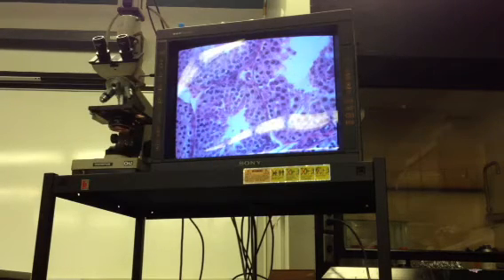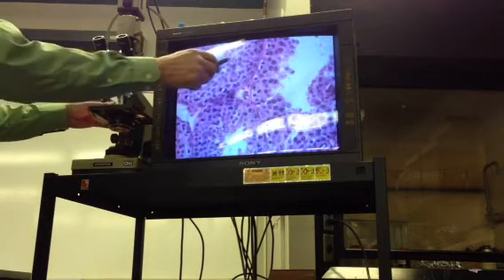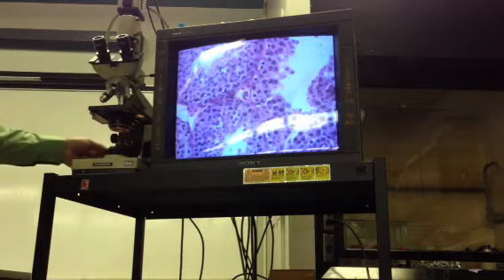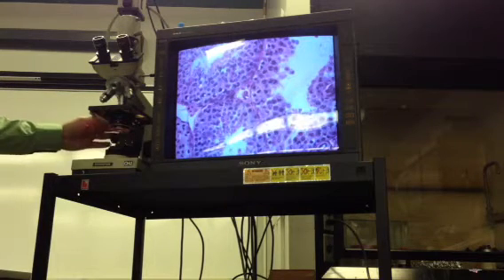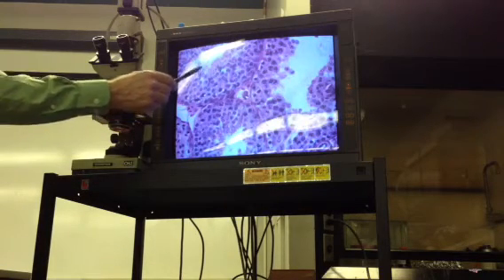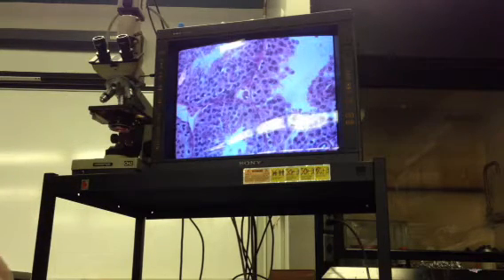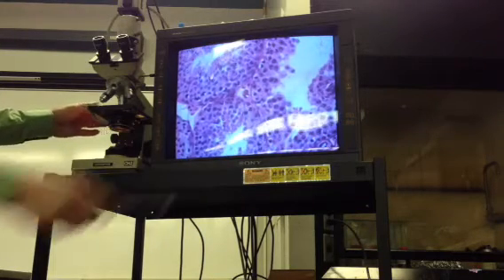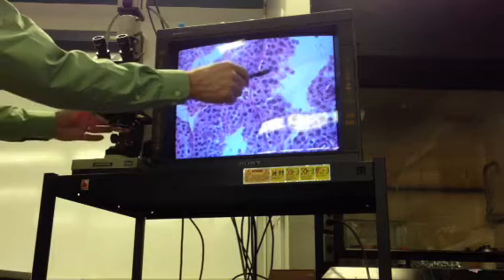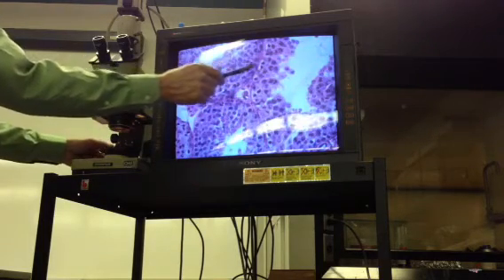And spermatids, yeah. Those are the little ones, tiny, the ones right before the spermatozoa. So these would be good. There are spermatozoa along with spermatids. These are hard to differentiate. Well, some of them are and some of them aren't. That's why I say spermatogonia, this is pretty obviously different from this, don't you think? These are primary spermatocytes, these are spermatogonia.